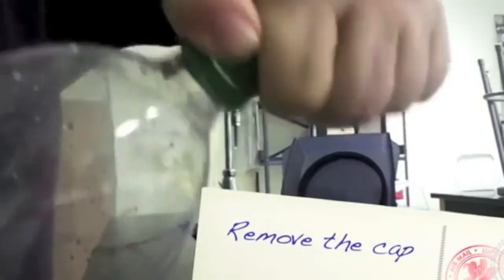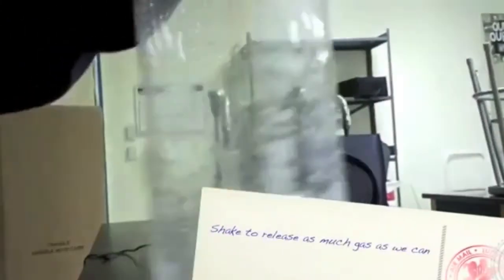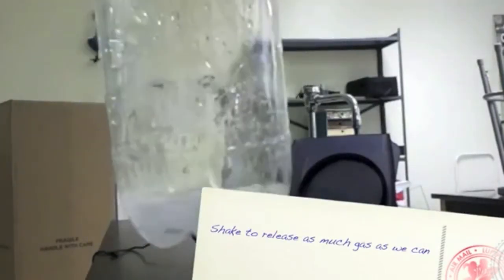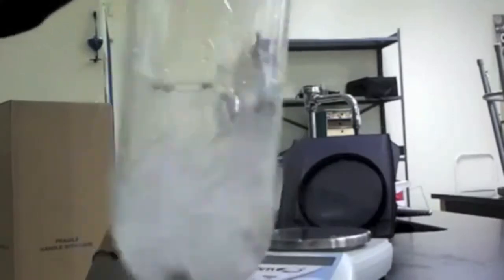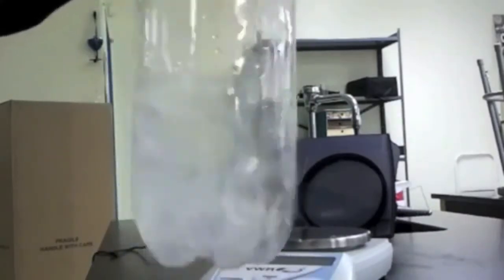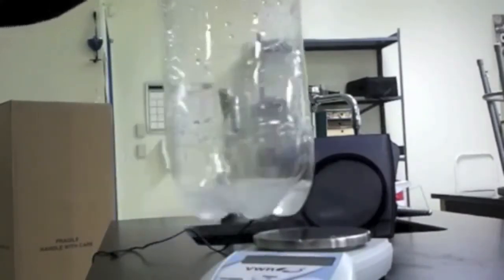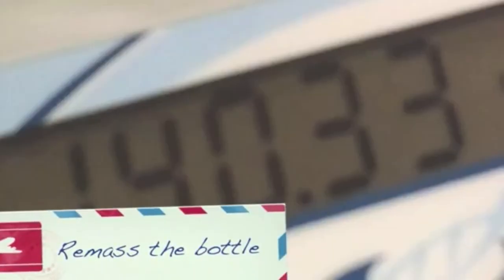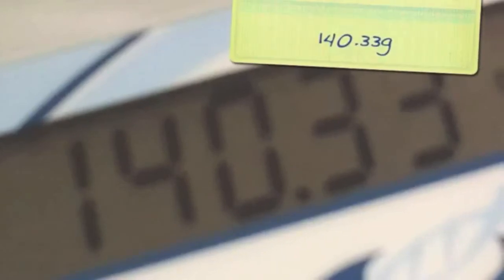What happens if we remove the cap? Will we be able to measure the mass that's lost? I'm going to shake it to get as much gas released as we can. Put it back on the balance and record the mass — it's 140.33.